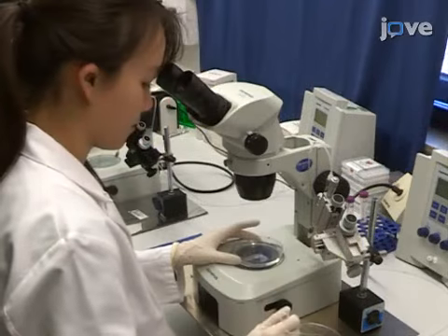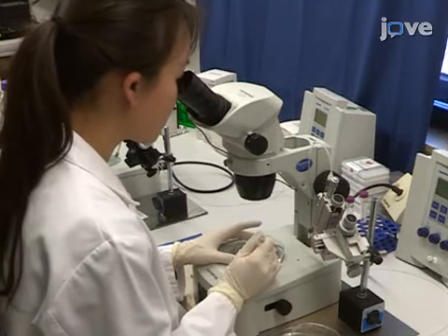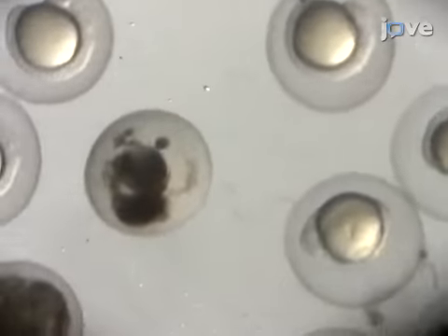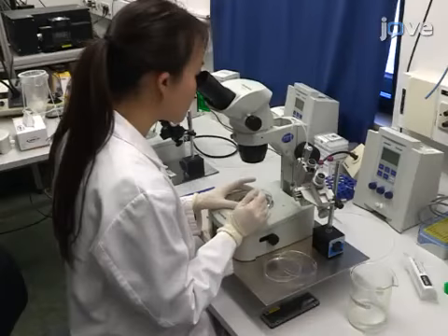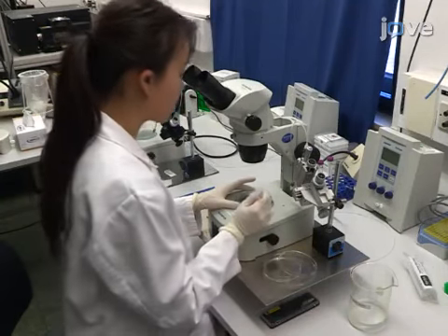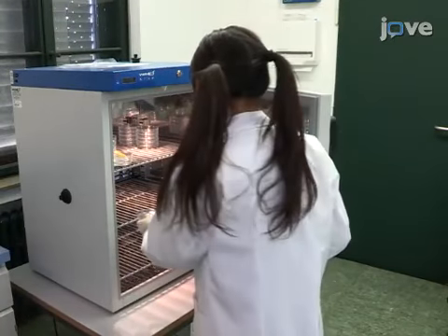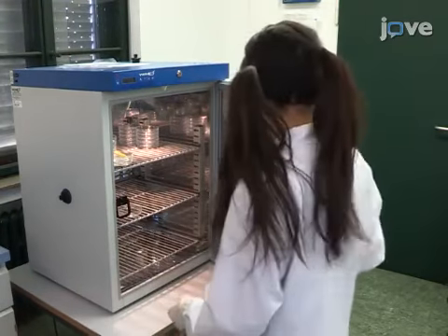After generating transiently expressing embryos by microinjection, or obtaining embryos from stable transgenic lines according to the text protocol, at the end of day 1, screen for dead or unfertilized eggs. Using a plastic transfer pipette, transfer the viable embryos to Danieau solution containing 1X PTU to prevent pigment formation, and maintain the embryos in Danieau solution containing 1X PTU until screening for transgene expression.